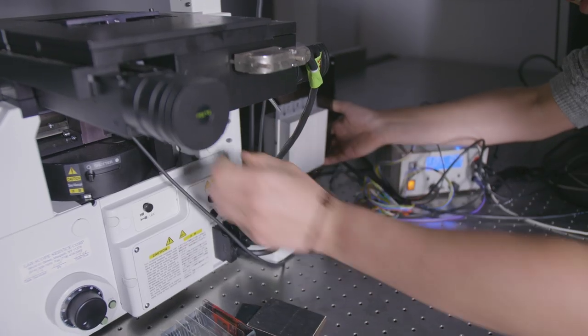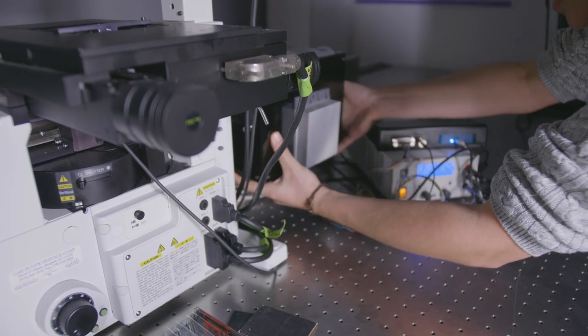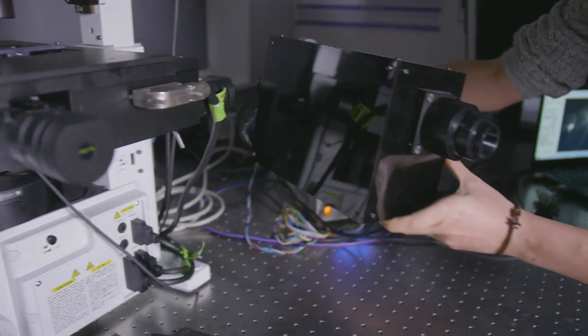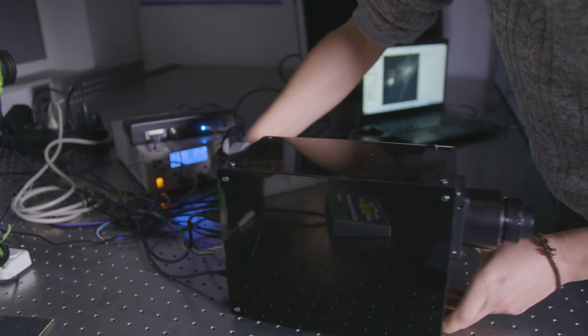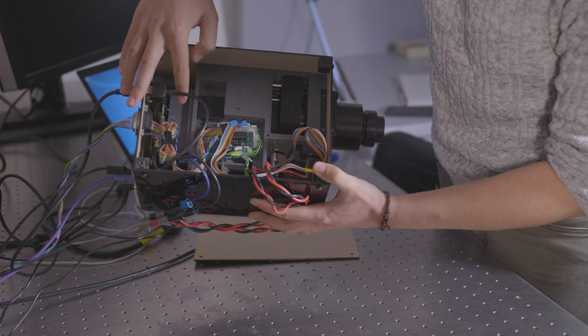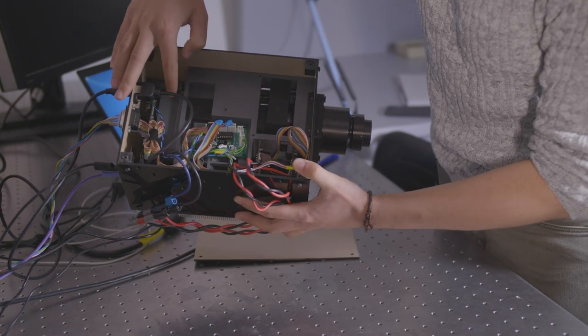When you build a microscope to share with others, you need to take into account that they will not know the system. You need to build something that is easy to use and properly documented. Because it is open hardware, we need something that one can build without using too complex instruments, that does not require too many tools or too heavy maintenance.